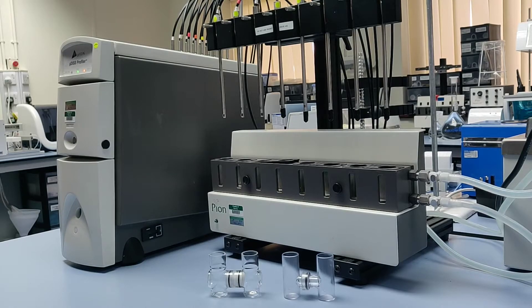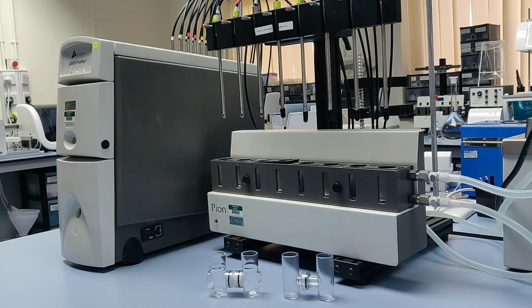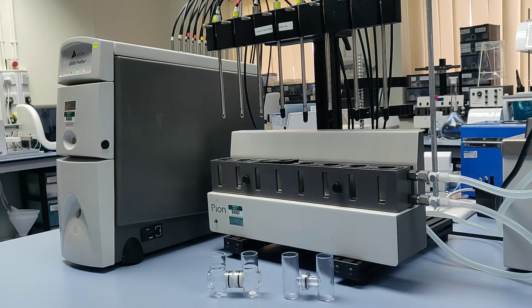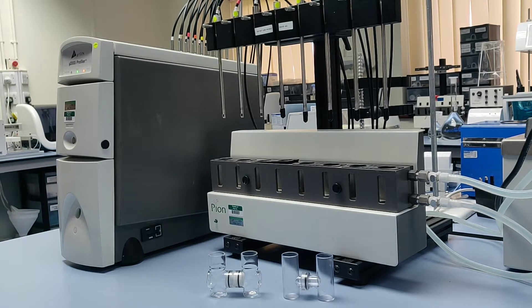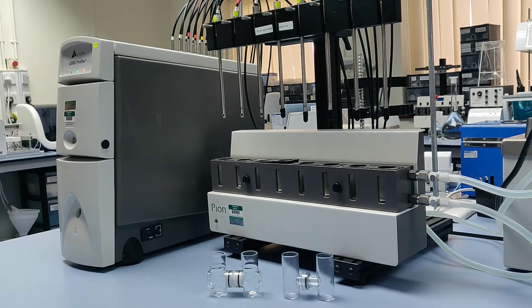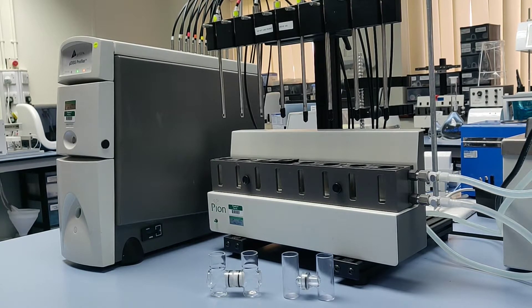The Microflux is a small volume flux apparatus which utilizes the MB8 and Rainbow as a platform to run these assays. The flux pairs consist of two 20ml chambers separated by a PVDF membrane coated with a GIT lipid solution. The movement of compounds across this membrane simulates absorption of a drug compound in vivo.